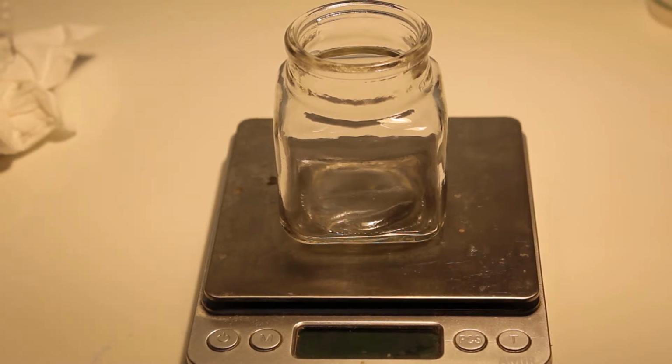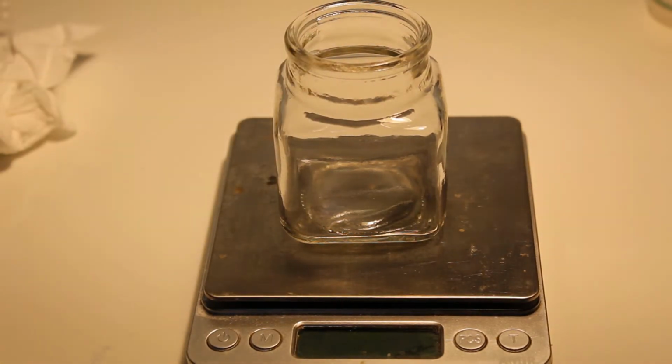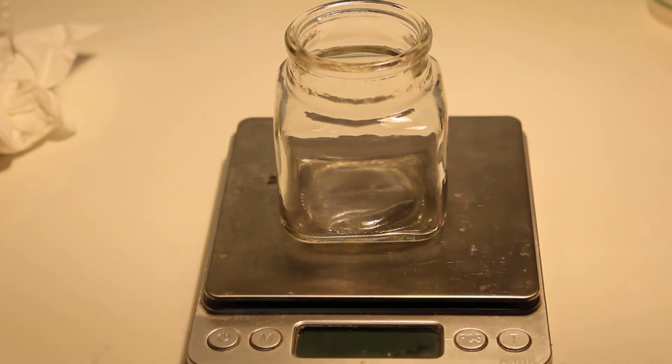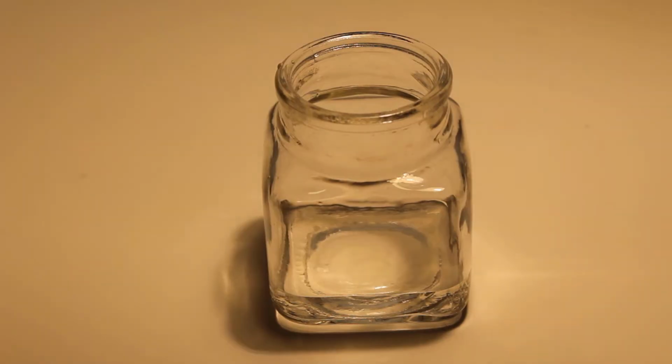Well, I couldn't make the test tube thing good enough. You see these holes? They're too big, so I'm going to have to fix that up. Maybe it'll be in another video. I don't know. But what I'm going to do is just pour the water directly into its container. Okay, so we need 15.63 grams of water. Good enough. So we have the water.